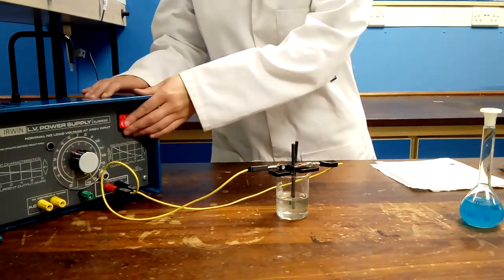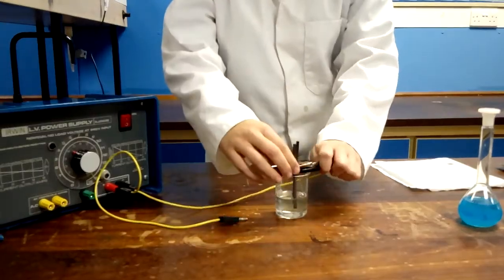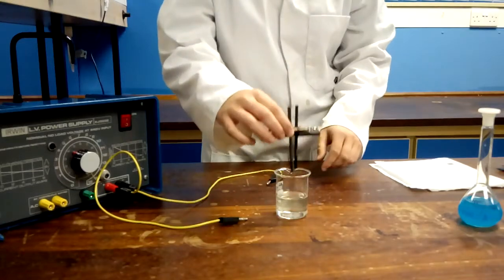To finish, make sure you switch off the power supply, disconnect the circuit, and ensure that all equipment is cleaned.